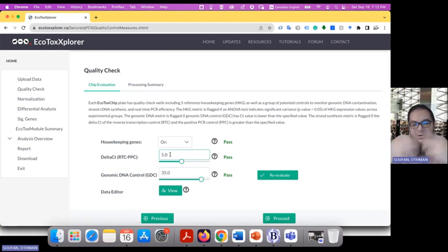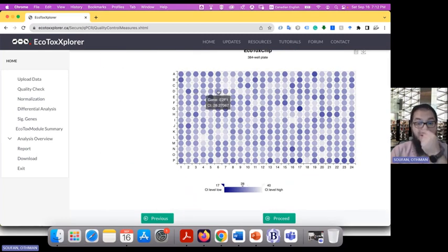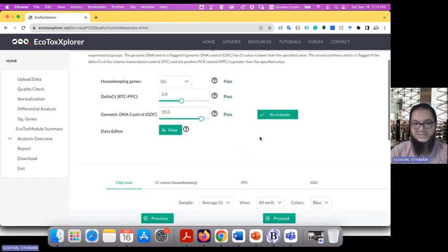Still in this course, we are hoping to gradually dive into more and more programming. This is a visualization for the chip. I myself made this visualization. So all that you see is CT values. As we put the CT low and high values, we can see all the range. However, if we limit this, we can explore which specific genes meet our own constraints. So we have gene XDH, for example, and we can read the CT value here. Now, this would be subject to further analysis.